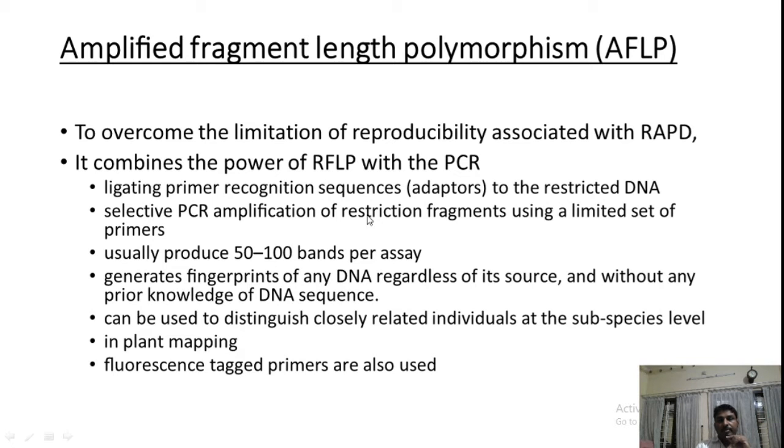Now, I wanted to discuss AFLP, that is Amplified Fragment Length Polymorphism. This is a PCR based marker technique.